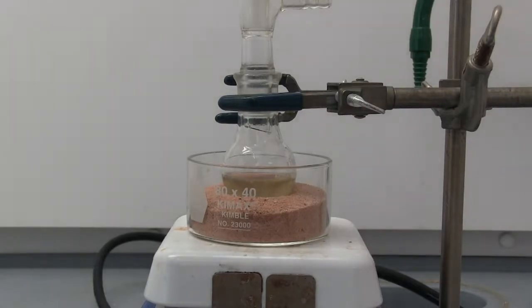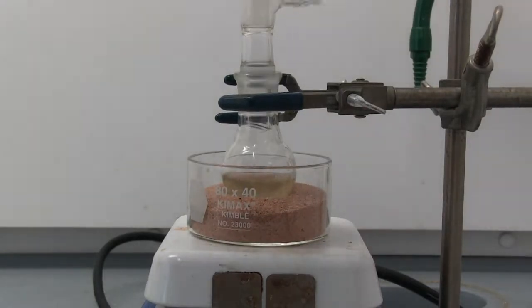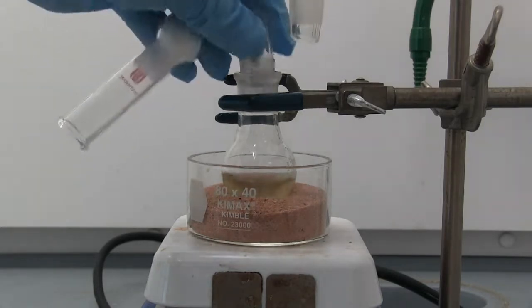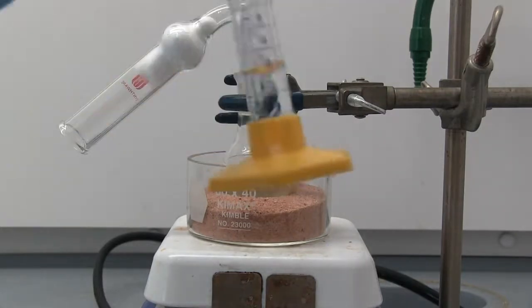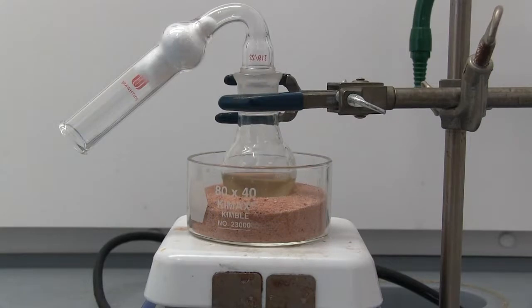All right, so I'm going to take off our water condenser and bring our drying tube back to here. And now I'm going to slowly acidify it with 3 milliliters of 3 molar hydrochloric acid and we're going to let it stir while it's, keep it stirring while it's going.